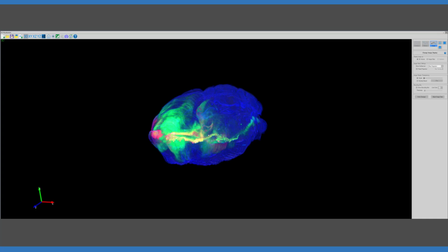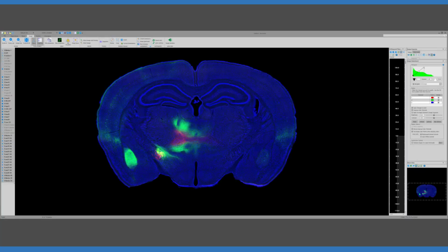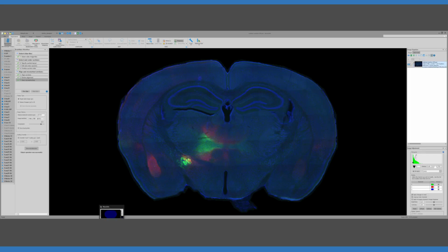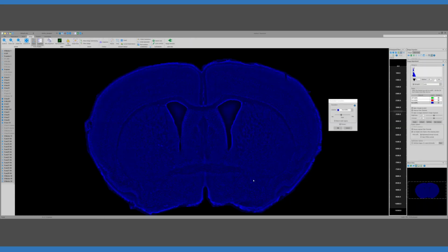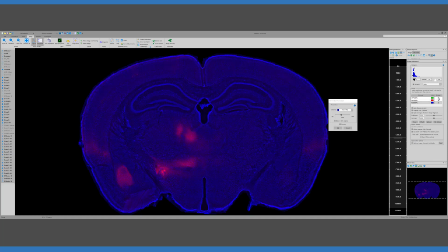Chip, just to jump on that point a little bit. What we're doing is we're really changing the evenness of illumination in the counterstain, which brings out all the architecture for us, so that our eyes can see that in an even way throughout the stack. But we're not really touching any of the tracer data that we've imaged. Exactly. That's a good point to make.